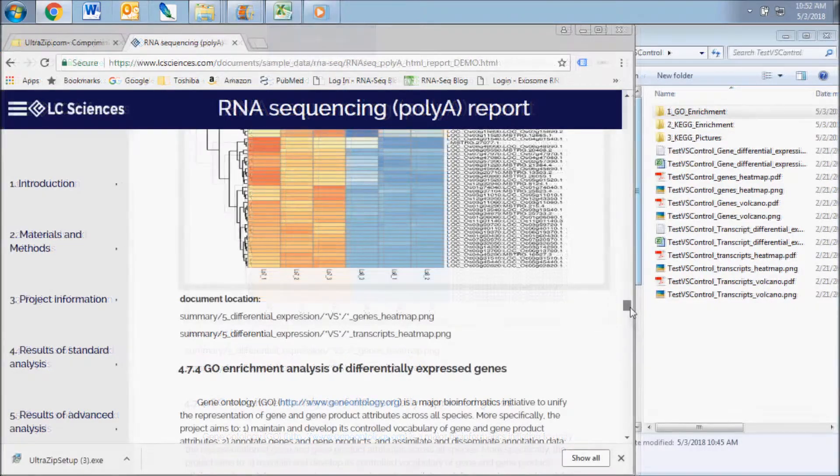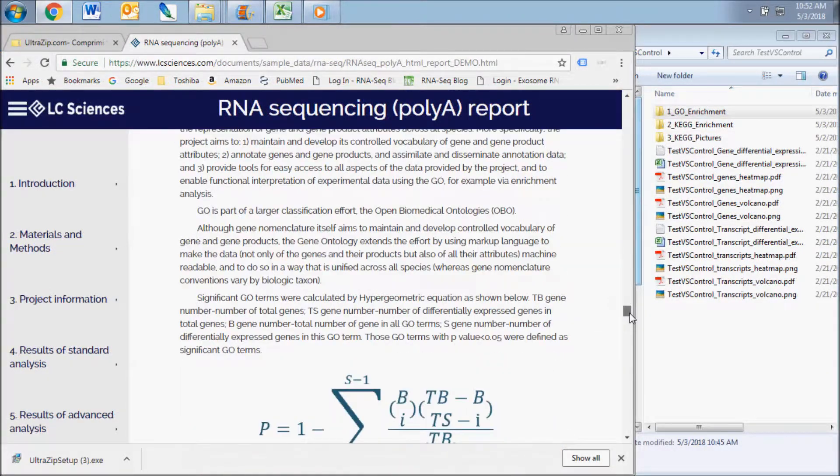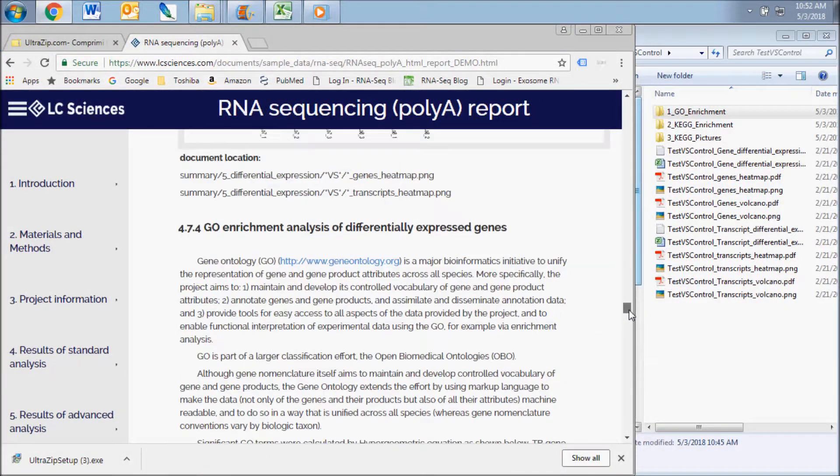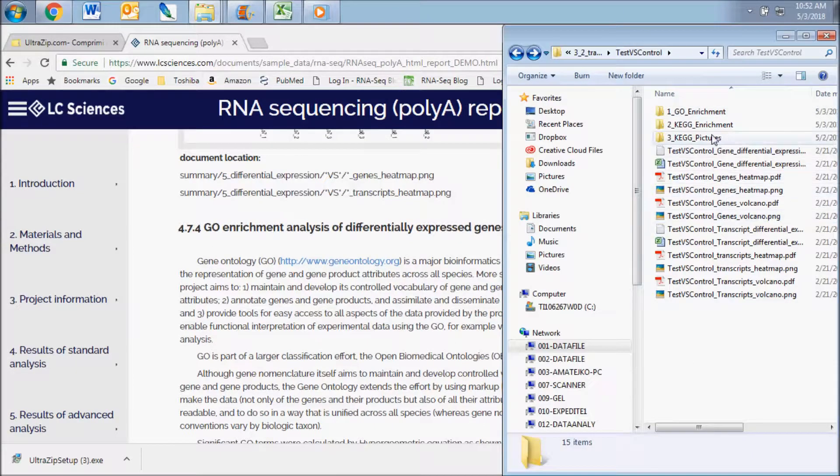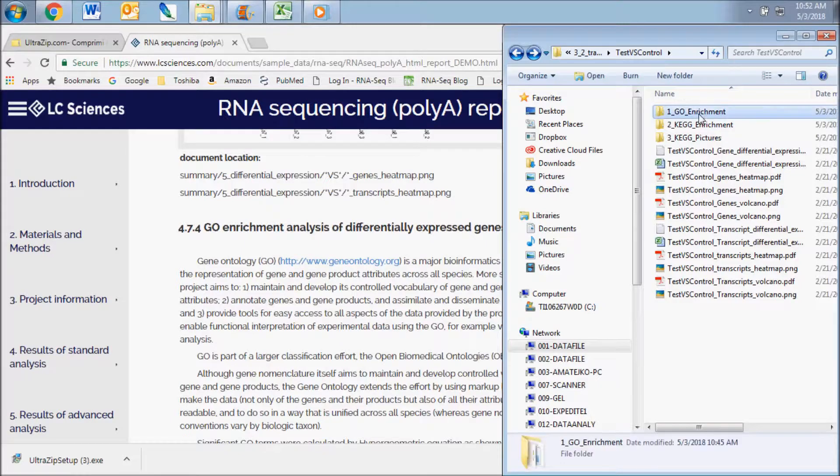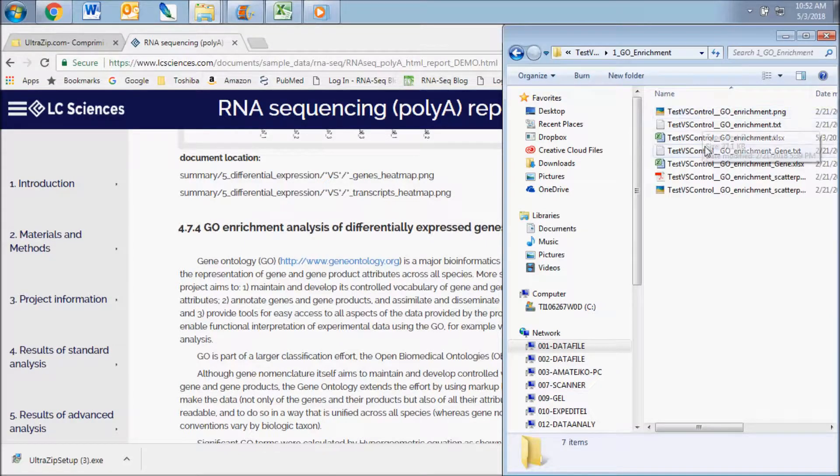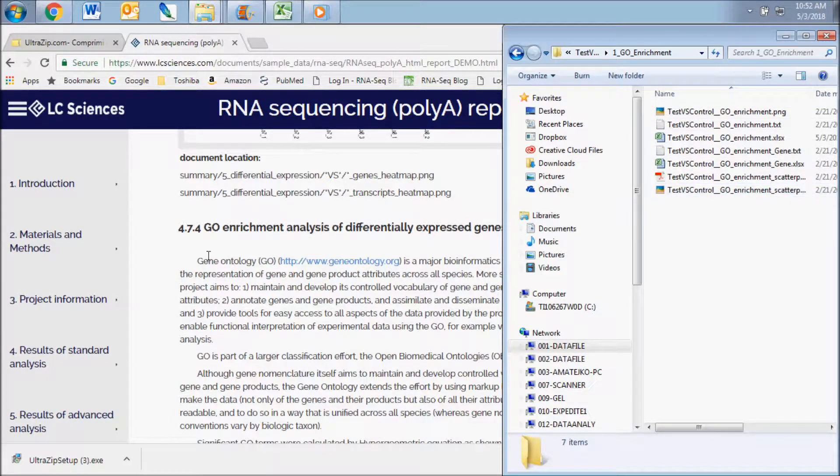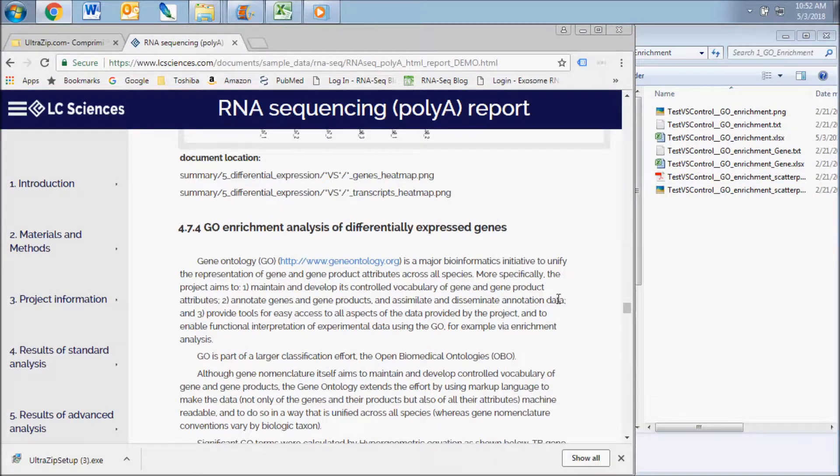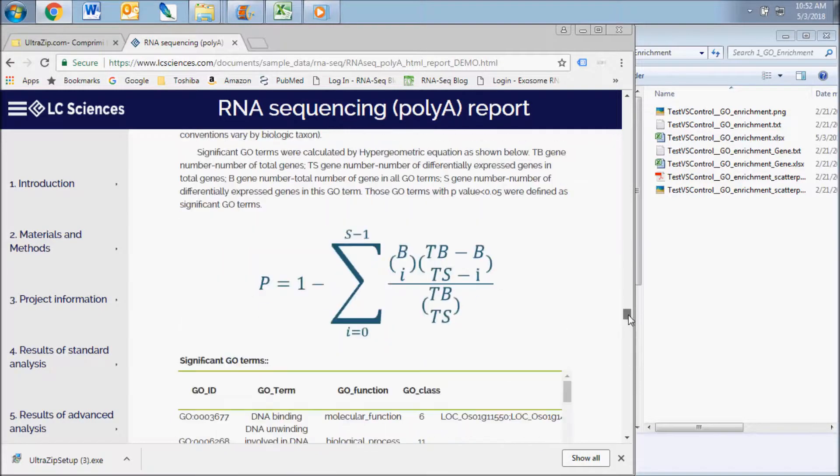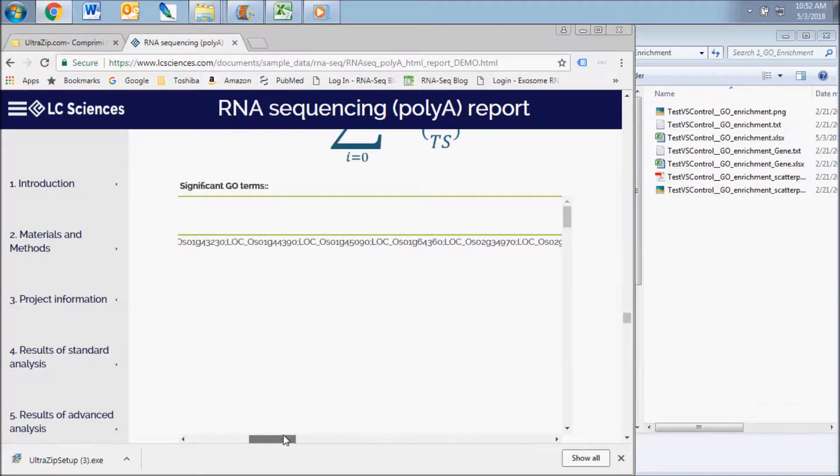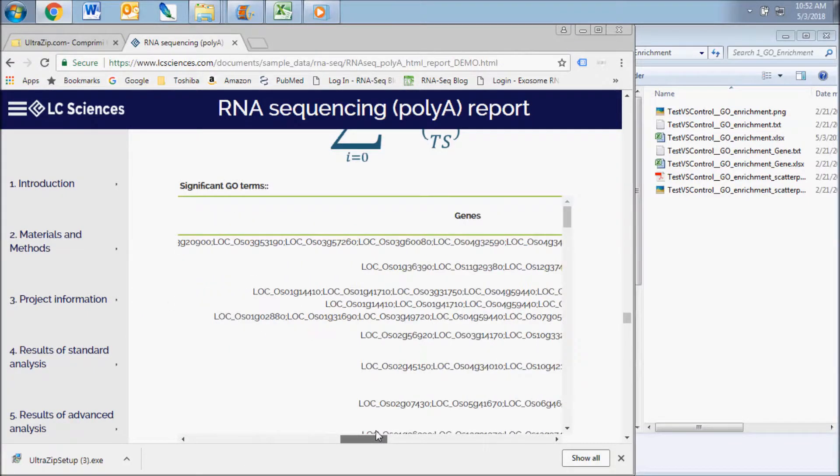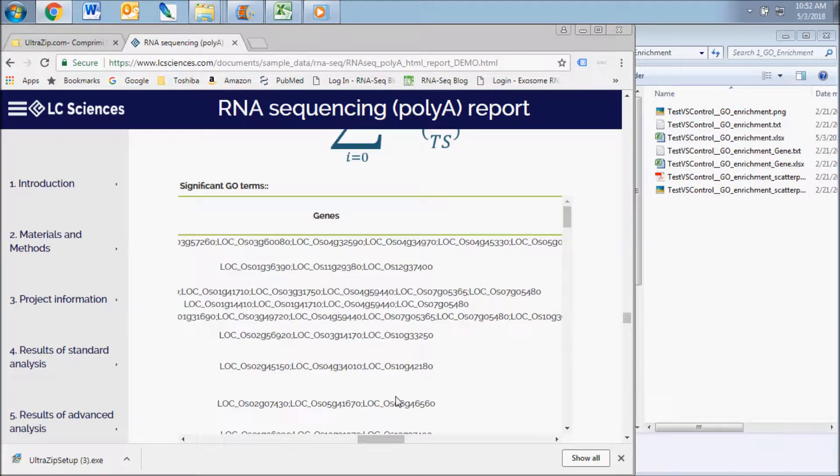The next results subsection displays the gene ontology enrichment analysis of the differentially expressed genes. This data is contained in the GO enrichment subfolder of the group comparison folder. It includes a list of the significantly enriched GO terms based on the differential expression of genes and transcripts within this comparison.